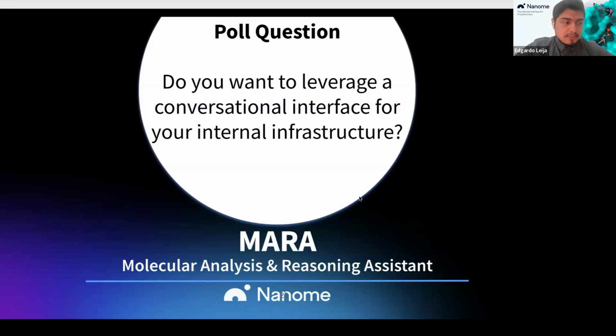It's meant to be internally hosted. And in the public beta, yeah, I would not push any proprietary data on the public beta, but we're happy to discuss what an enterprise solution could look like for you.